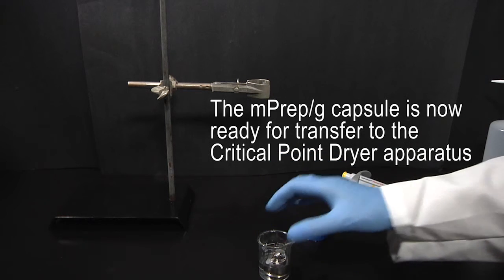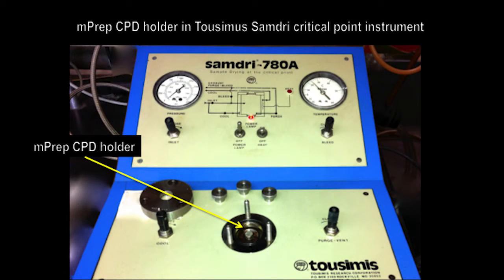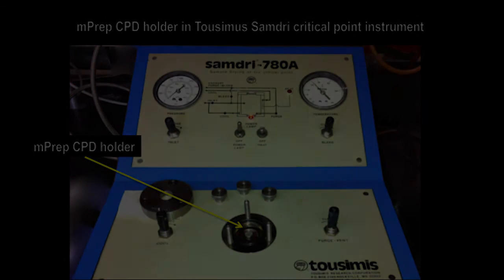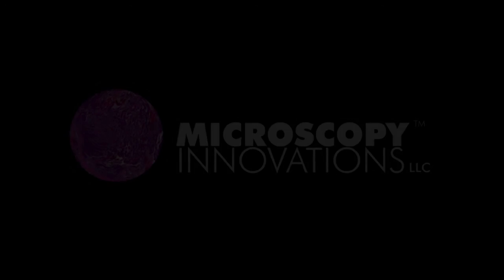A single MPREP-G capsule ready for transfer to the CPD apparatus. The MPREP-CPD holder for the Tosimius Samdry critical point dryer can accommodate up to six MPREP-G grid or MPREP-specimen capsules in any combination. For further information, please contact Microscopy Innovations at info@microscopyinnovations.com.